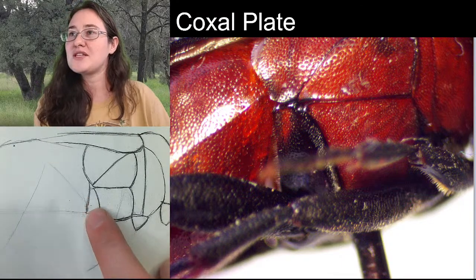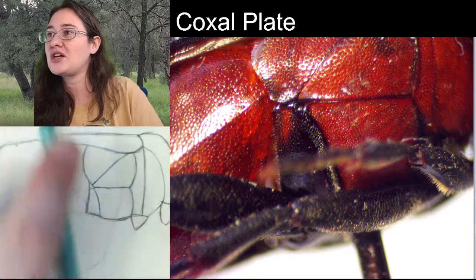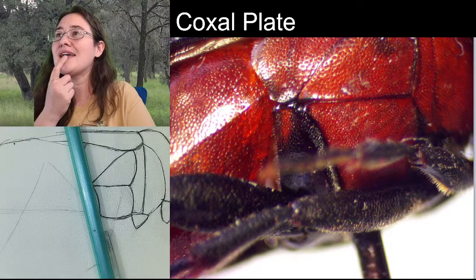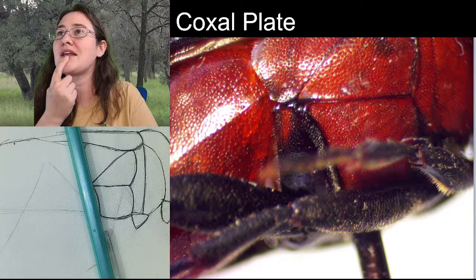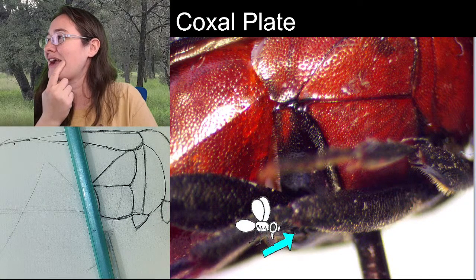And so that's what this is. This is a coxal plate. And that's where the femur is going to connect directly to. You can kind of see that the femur would connect right about here. Right there.